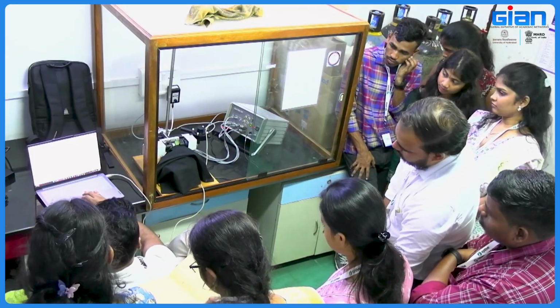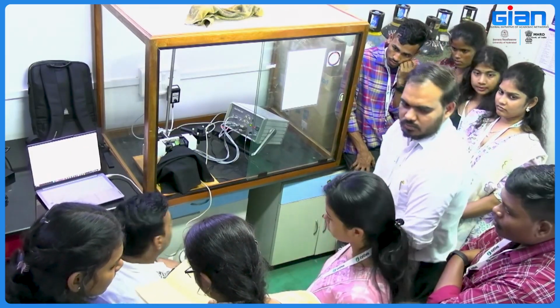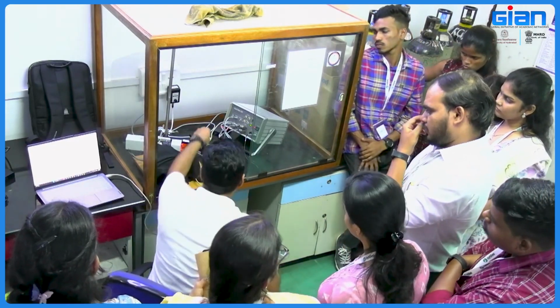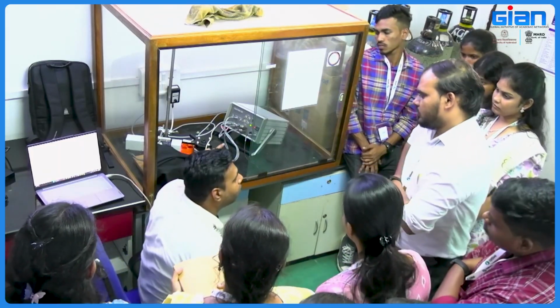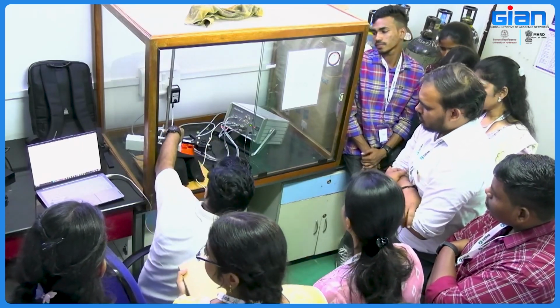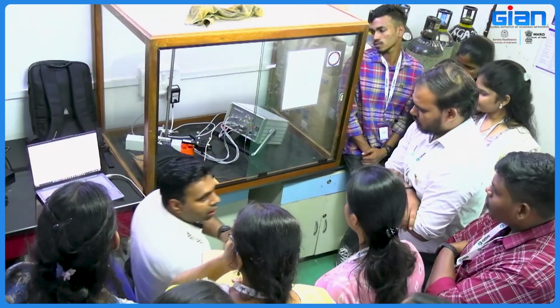So anybody wants to do? Can you explain the algal system? Yeah, for algal systems basically everything is the same. The only difference is that because these are liquid cultures, you have to use a cuvette. Minimum 1 ml is enough. These two systems will be fitted over these two regions. That's it. Nothing else differs.